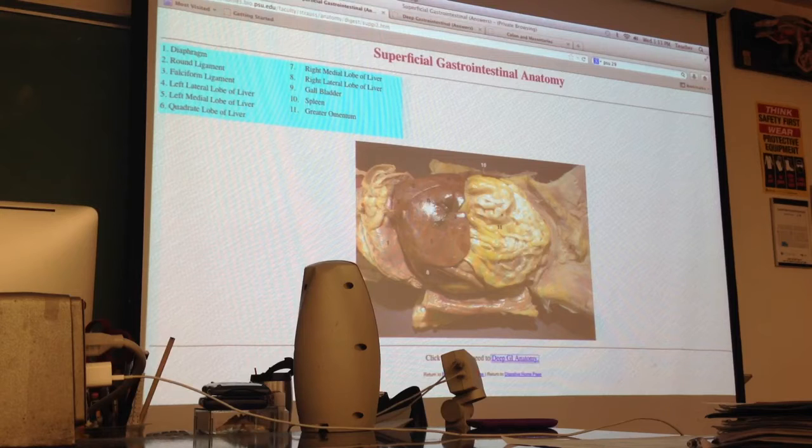Okay? You'll see that this is all going to gather on the stomach, and I'll point that out again on the next view, but I just want to show you the other things we can see externally. This whole big thing, the first organ that you'll see underneath the diaphragm, is the liver. Now if you look on the left-hand side of the cat, kind of near the liver, you're going to see that there's a structure that looks exactly like the liver, but it's not attached. That is the spleen. Okay? That's on page 13, but you do need to know that.